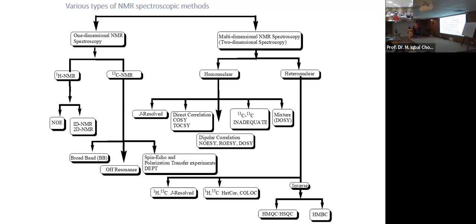So they have the expertise, we have the expertise. If they cannot do it, we can optimize. Me, Dr. Sumaira and Dr. Mara, we have been trained in setting up NMR experiments. So we can set up the NMR experiments, but the requests need to be generated from you guys.